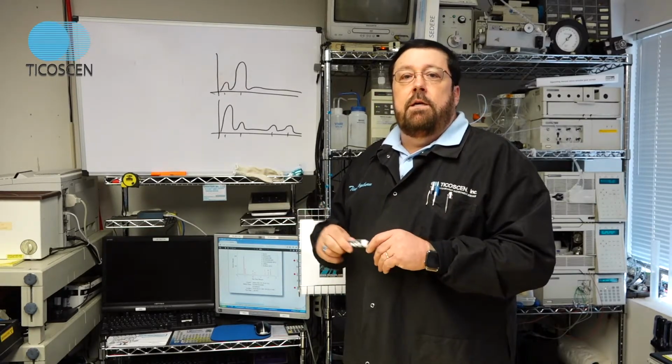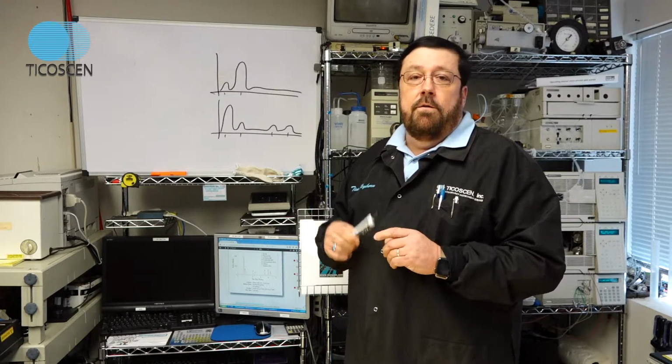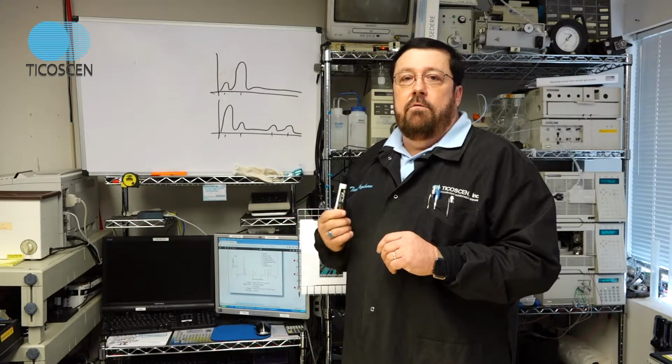So when you use an ELSD, you're going to see things that you may or may not want to see. But that's what they're there for. They're there to help you assure the purity of your compound.